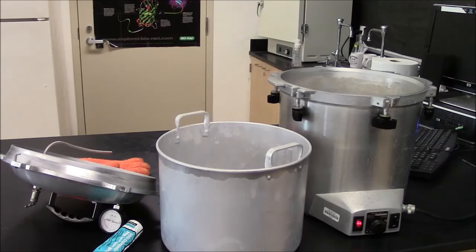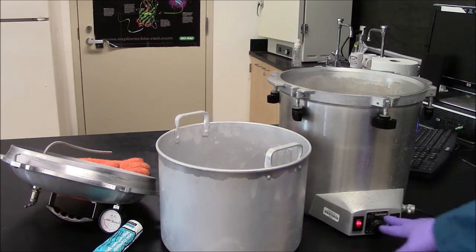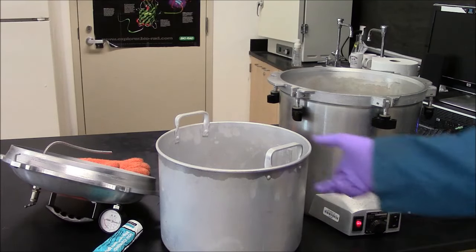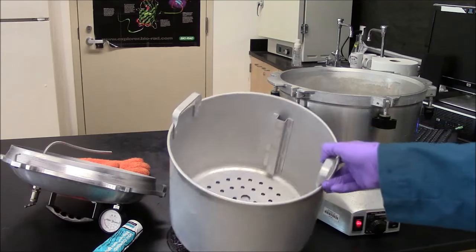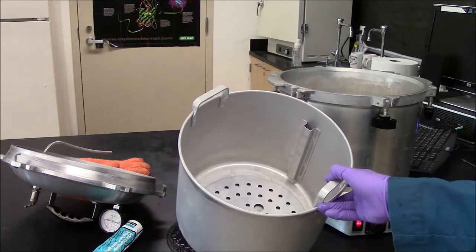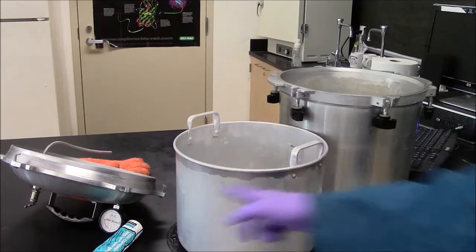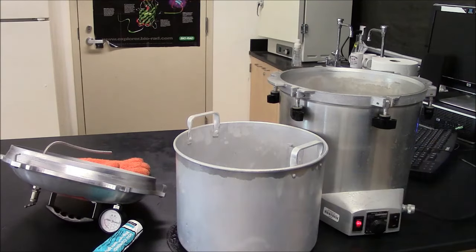The steam sterilizer has a main unit here. This is the electrical part. It has an internal container in which you put your samples to be sterilized and it has a lid to keep the pressure in.